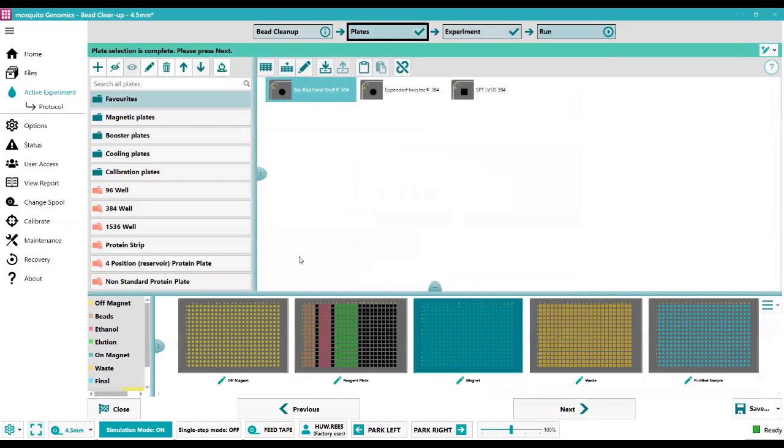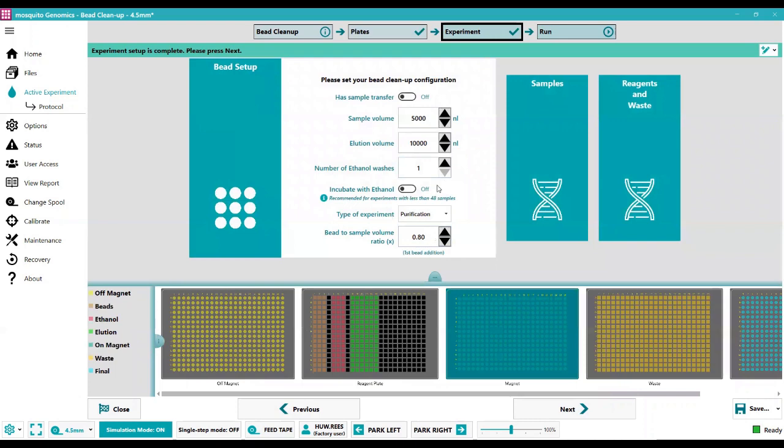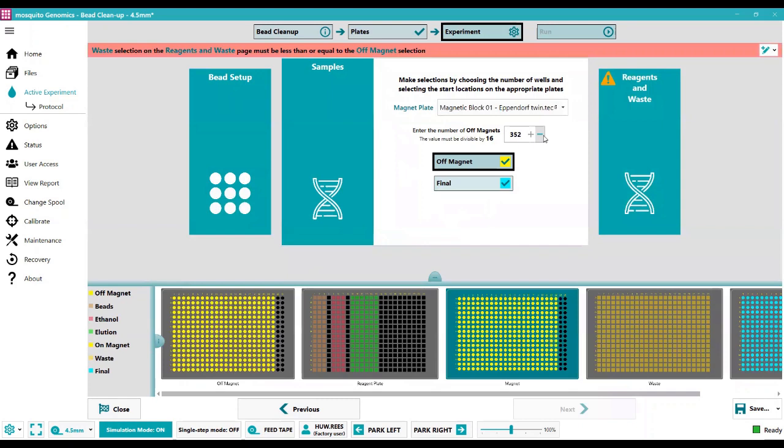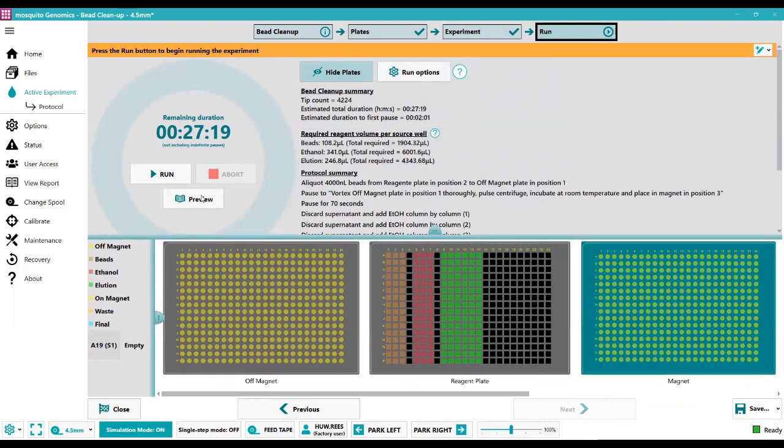Under the plates tab all five plates are shown and can be swapped by dragging and dropping. The experiment tab gives options for the bead-to-sample ratio, number of ethanol washes, and whether to incubate with ethanol. Under the samples page you choose how many samples you're running, and under reagents and waste you choose which columns to use for beads, ethanol, elution buffer, and so on. Once physically set up, you hit run on the run page.